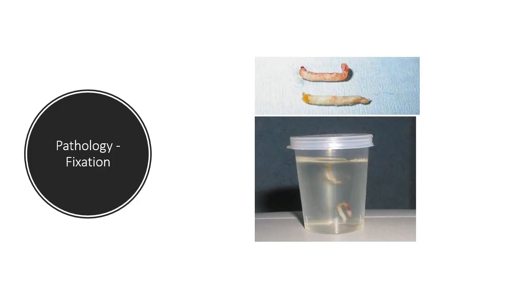After a specimen has been identified, the next step is fixation. In this step, the cassette is put into a fixative for 12 to 24 hours. This is done in order to keep the tissue the closest as it was in the body in order to get accurate results. The most common used fixative is 10% neutral buffered formalin.